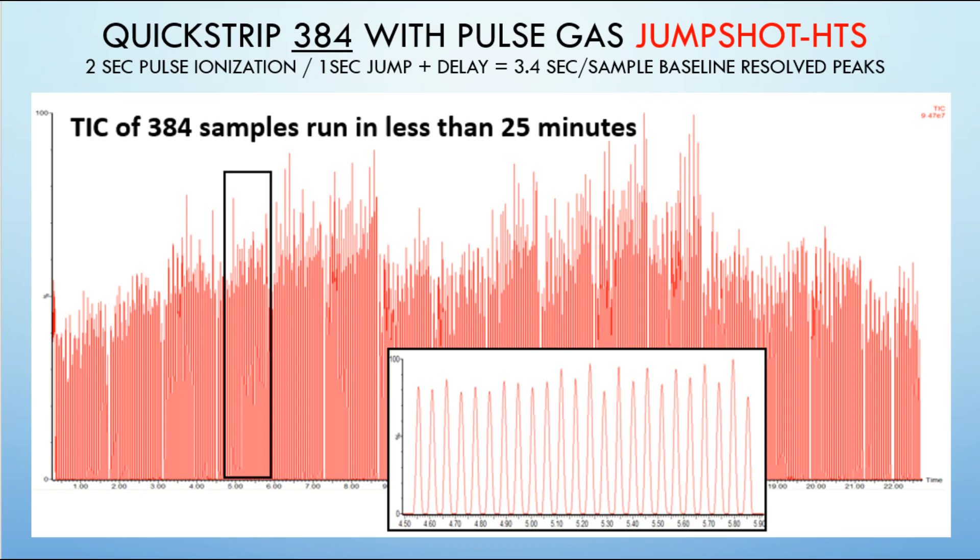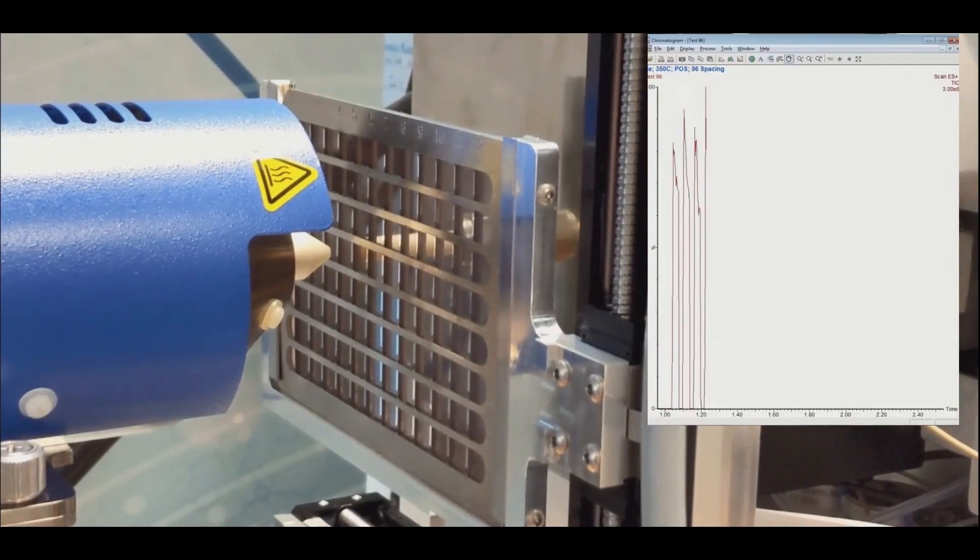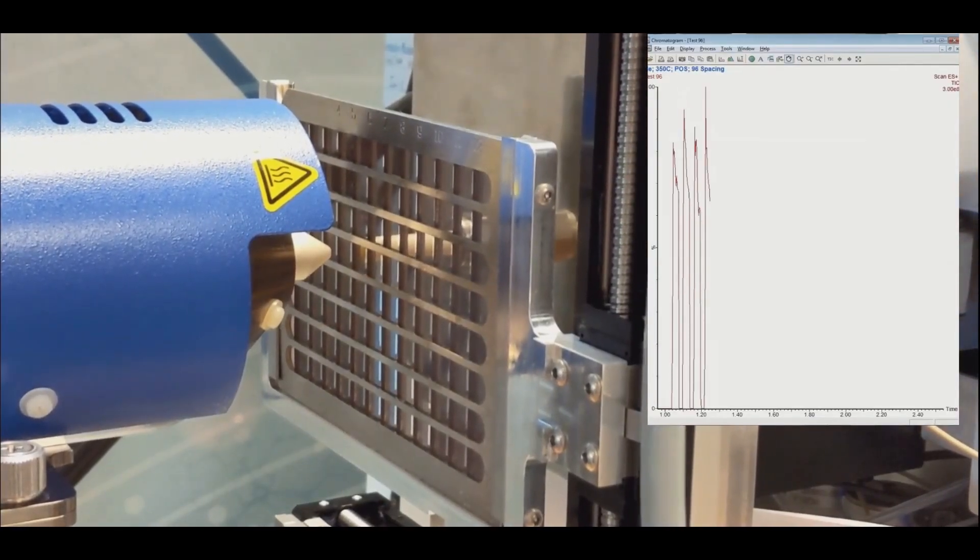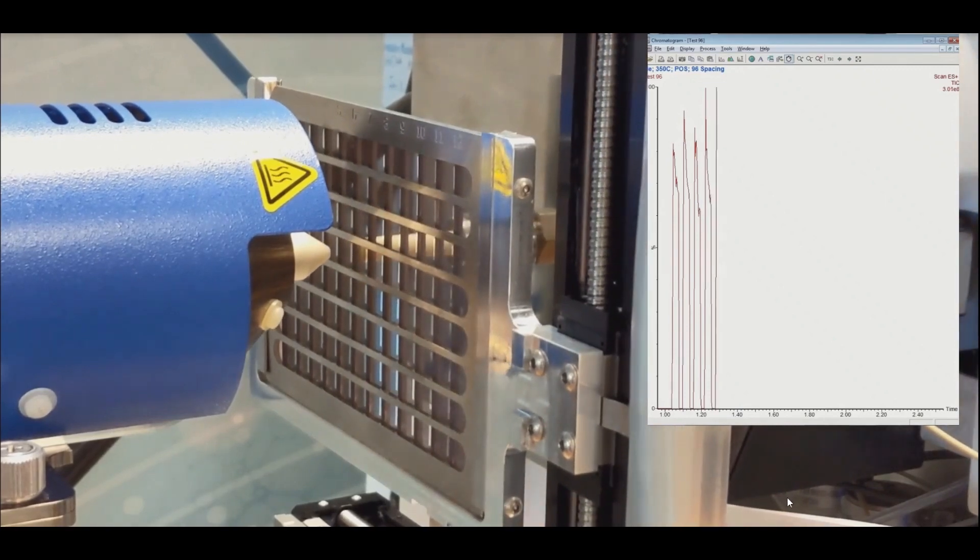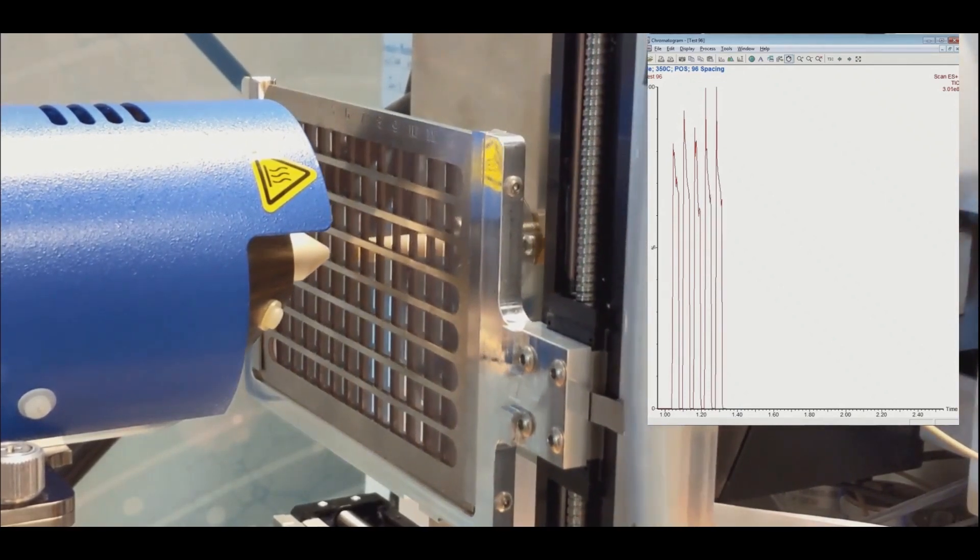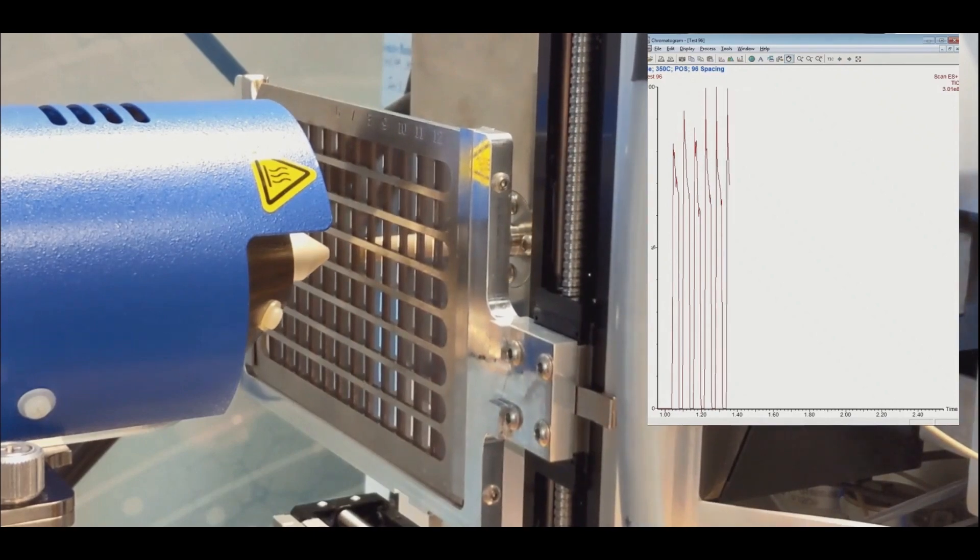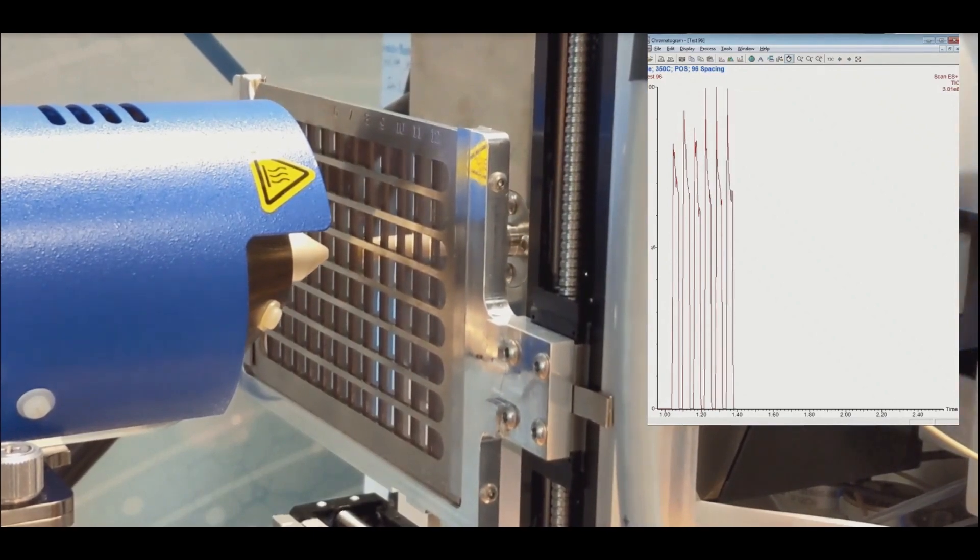Pulsed gas has also almost completely eliminated ambient background ions between samples while simultaneously improving target analyte ionization. Peak shape is improved as well, with sharper defined peaks that always return to baseline to facilitate post-analysis processing.